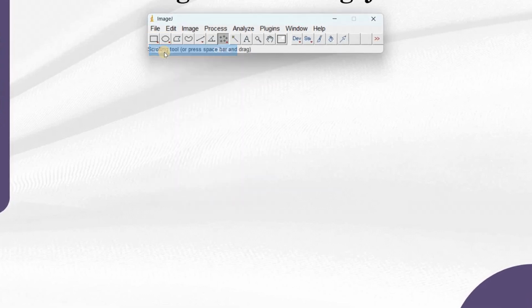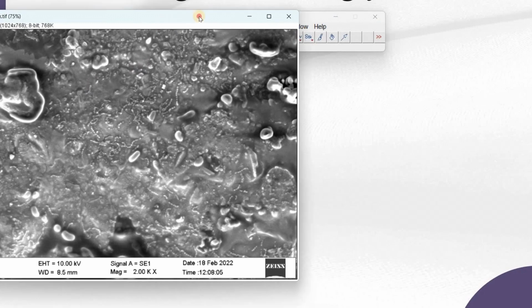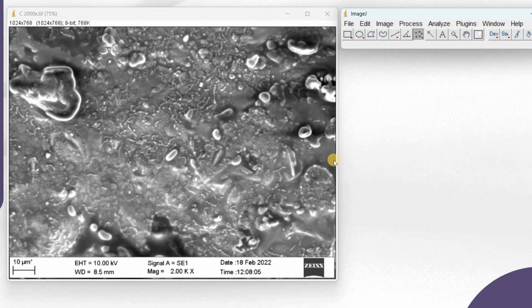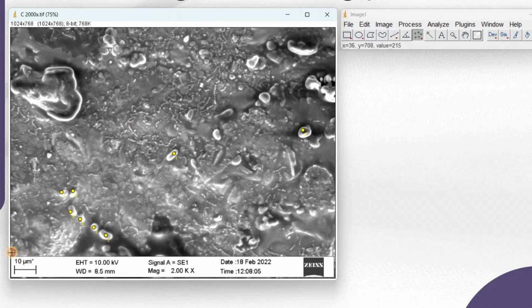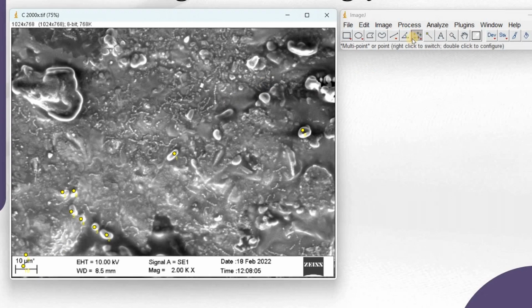So let's open an image, and such image analysis usually is where subjectivity comes into play. Usually when we have an image which doesn't have preset values of measurements or points. Say for example, this is an electron microscopic image and you do find certain elements like bacterial colonies which are present over here. And I have the total area of the image which is quite set because I have the measurement of the scale set over here. So when it comes to such an image, we need to count the number of colonies in a given area. That is called the point counting method.